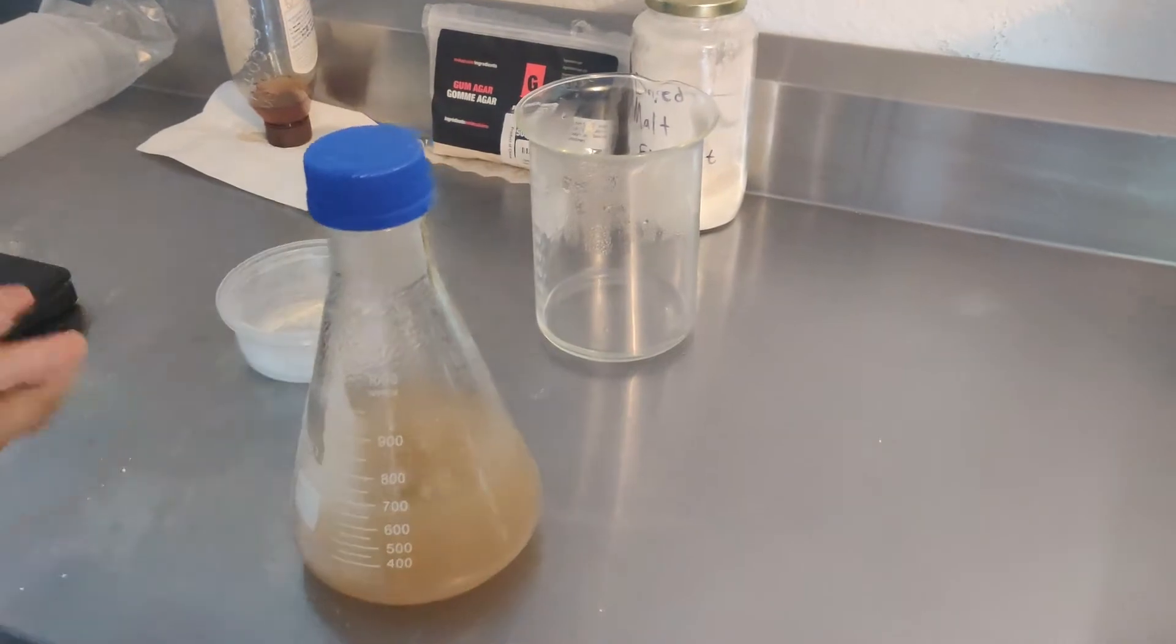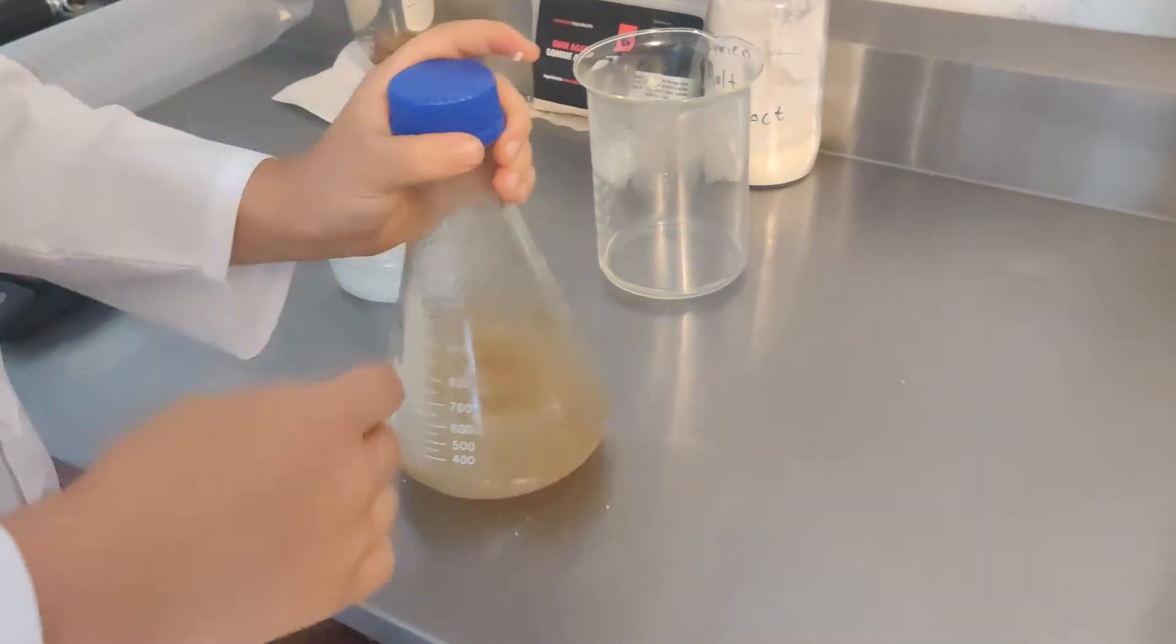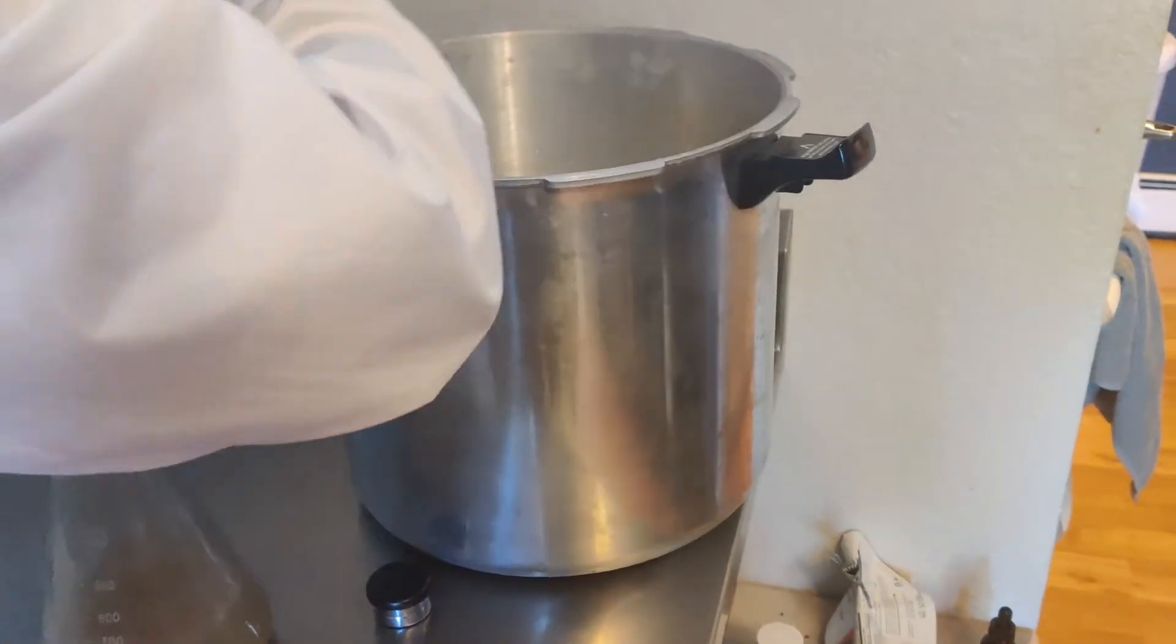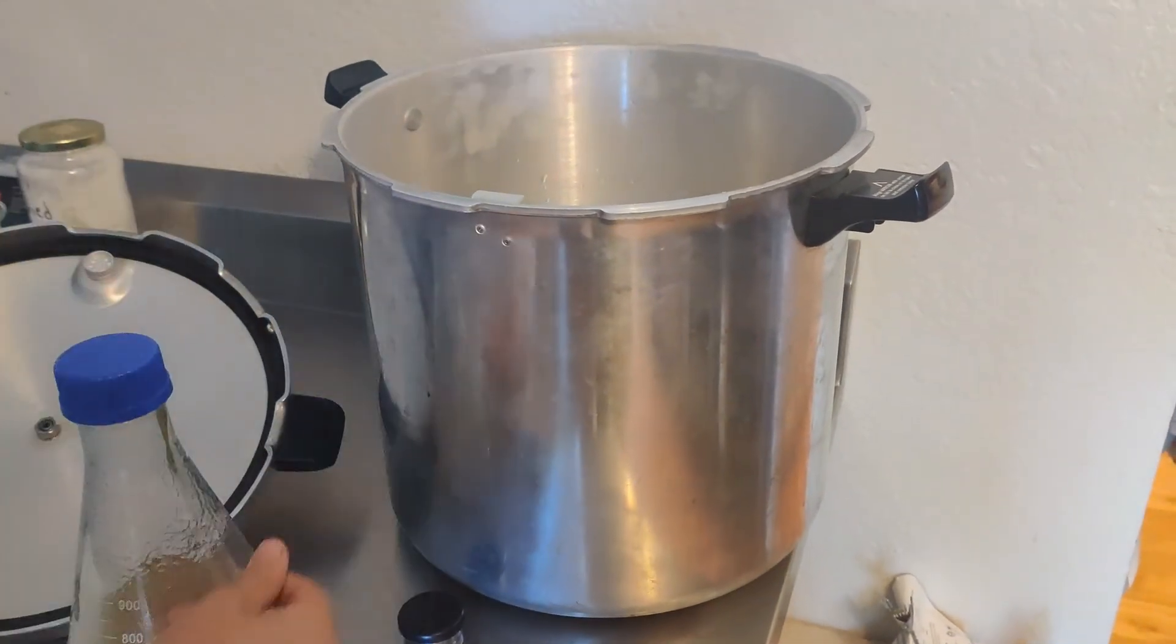Once that's good and dissolved, you can place it in your pressure cooker and pressure cook it for 30 minutes at 15 psi.